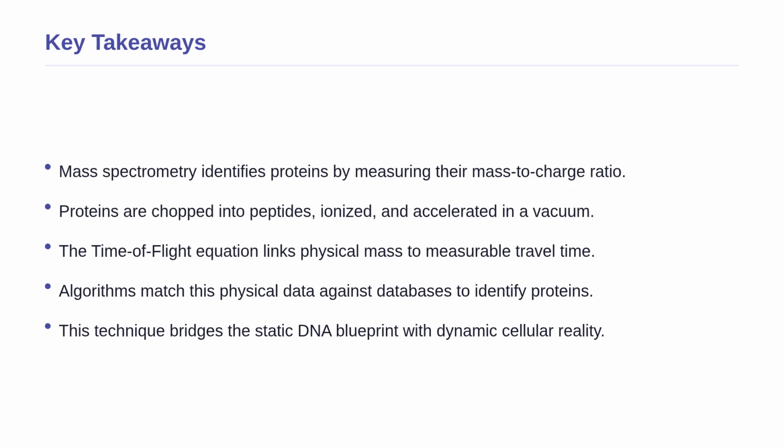Second, the time of flight equation is the mathematical heart of this process, perfectly linking the physical mass of a molecule to the microscopic fraction of a second it takes to reach the detector. Finally, by matching these precise measurements against biological databases, we bridge the gap between the static blueprint of DNA and the dynamic, living reality of the proteins that actually run our cells. You now understand the core of computational mass spectrometry.